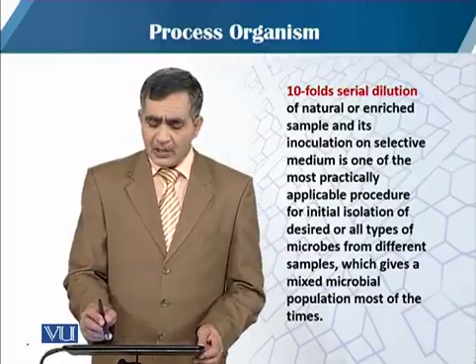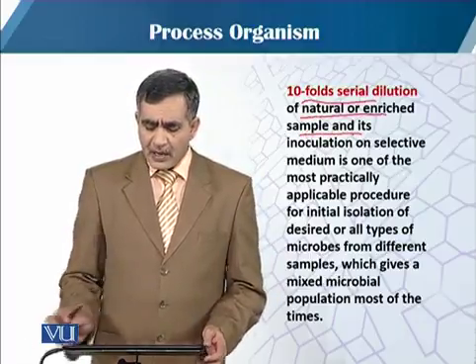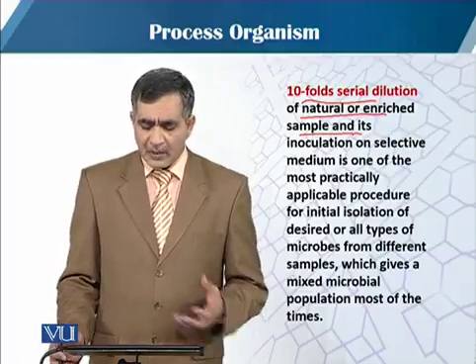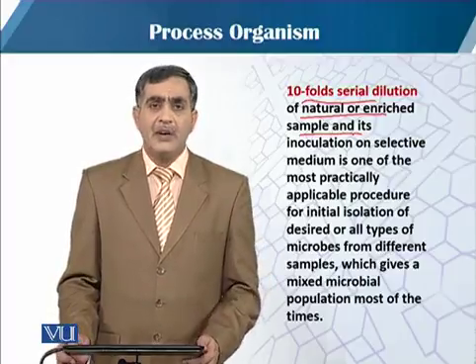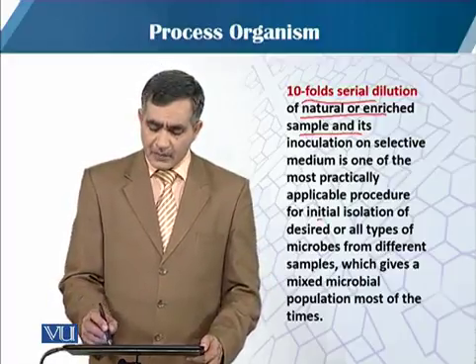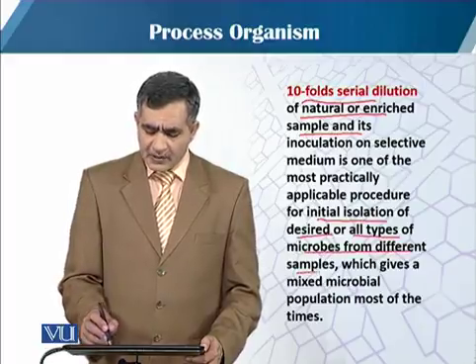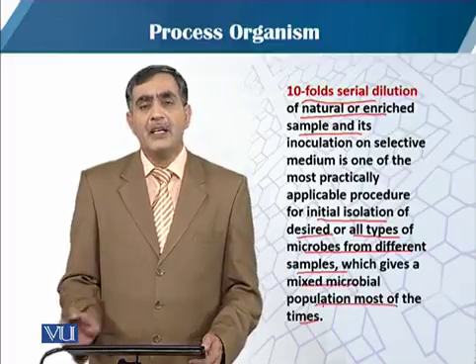The tenfold serial dilution on a natural or enriched sample and its inoculation on a selective medium is one of the most practically applicable procedures for initial isolation of the desired and all types of microbes from different samples, which most of the time give a mixed microbial population.